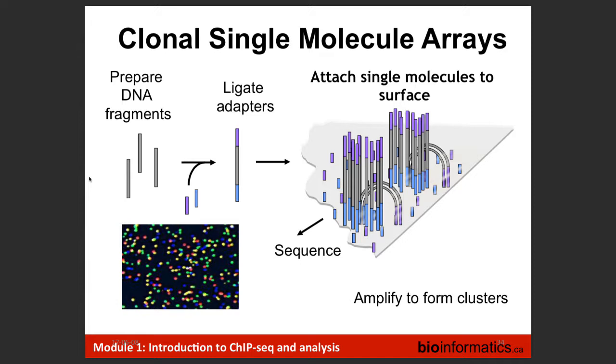That's a great question. What we've seen is that you'll get clustering based on the technology. We actually see subclusters emerge that are MNase. So if we take a set of data, say 50 ChIP-seq experiments, where some subset is cross-linked and sheared and some is MNase, you will get subclusters based on the technology. That said, I had a co-op student who worked six months trying to define standards of what those are. It isn't predictable in any way, but it is something certainly to be aware of. There are many regions where you're going to get readouts that are the same.